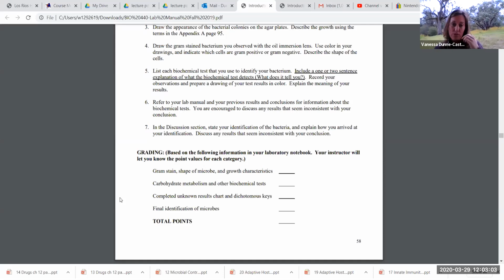Number two, as you're doing that, I think is the best way to do it, or separately, you're going to interpret your test results into characteristics of the bacteria. So again, for example, if your bacteria was yellow for glucose fermentation tube, then you would say in your conclusion section, in your one-page write-up, I use glucose fermentation to differentiate between this organism and this organism. Mine was yellow, which indicates it is positive for glucose fermentation and produces acid from fermentation, I guess you could just say.